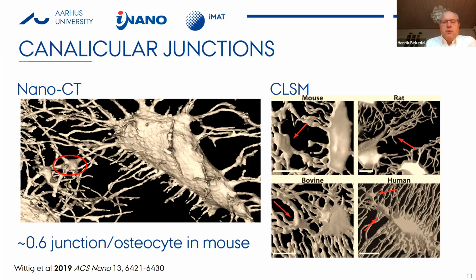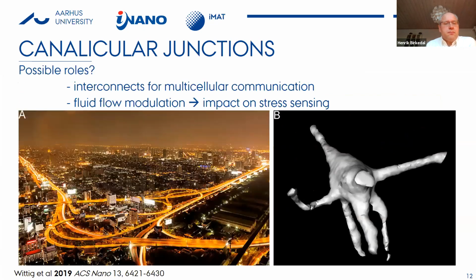So inspired by the work of Peter, we conducted the same experiment he showed before, using confocal optical microscopy. And we could see that in several different animals, we observed these junctions, and they're connected to the fluid network. So that means that they for sure impact fluid dynamics within the osteocyte lacuno-canalicular network.